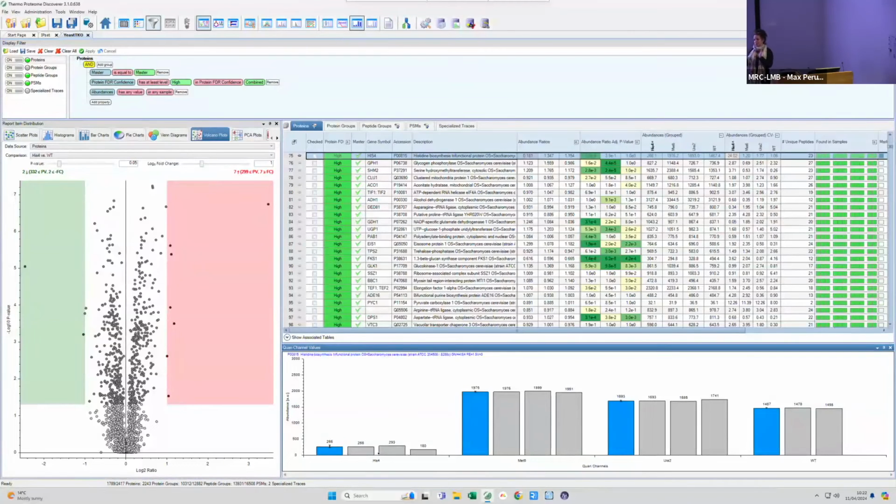When you select them to do the quantification, they also get fragmented. So you have the TMT values, or the reporter ions, coming also from these peptides that were co-isolated. And sometimes this is what happens. So this is one example.